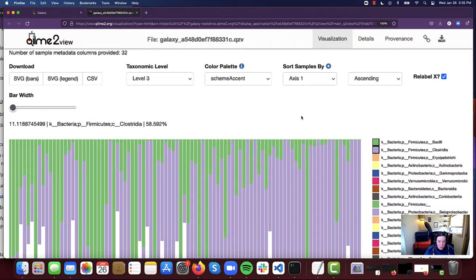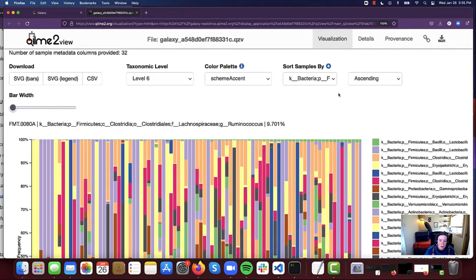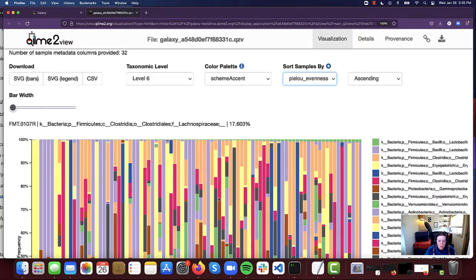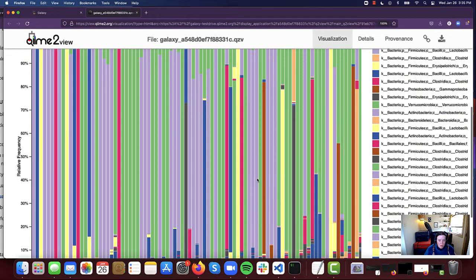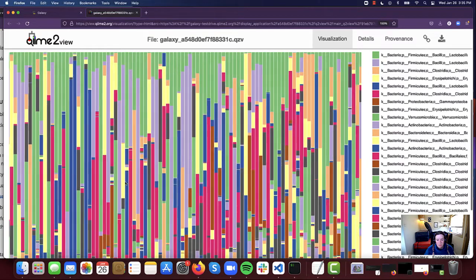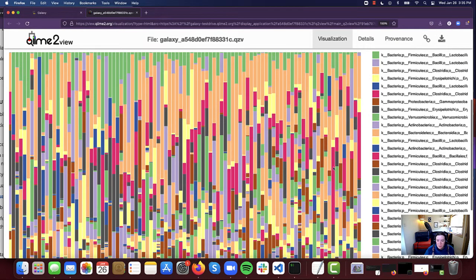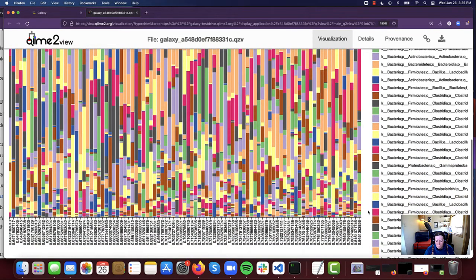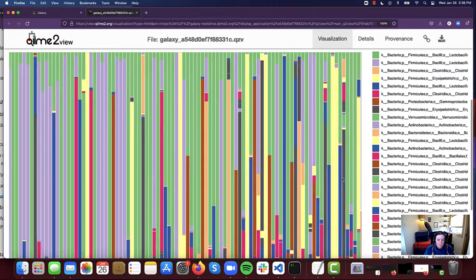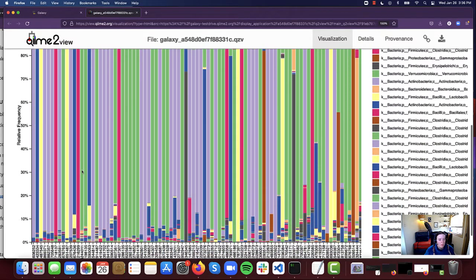One more example I wanted to take a look at — I'm going to increase our level to level six so we're looking at a lot more detail, and then I'm going to go ahead and select evenness as our sorting. As our evenness value increases, we can see kind of what we would expect: a lot more even distribution of these different taxa. At our highest evenness value, we're seeing a pretty even distribution, and on the other end we can see that we're pretty heavily dominated by primarily one taxa.